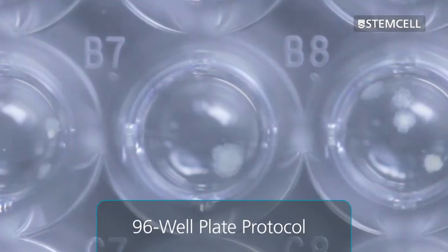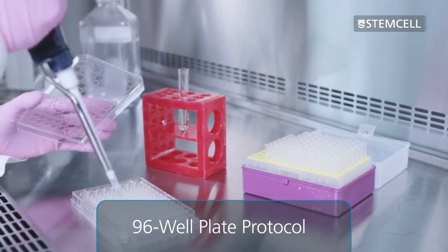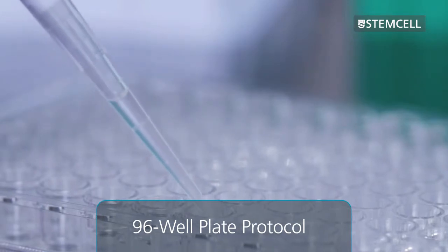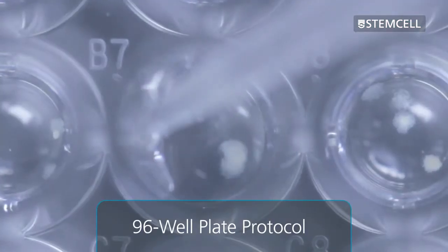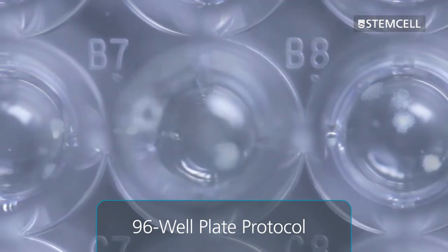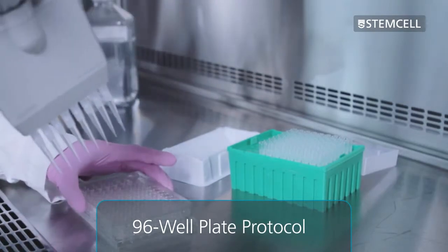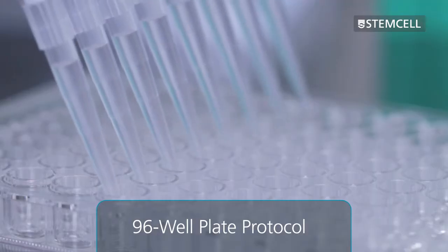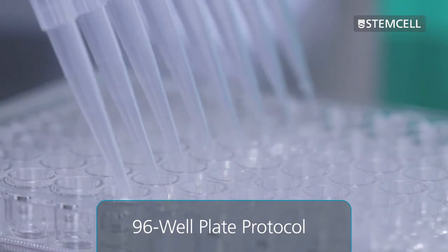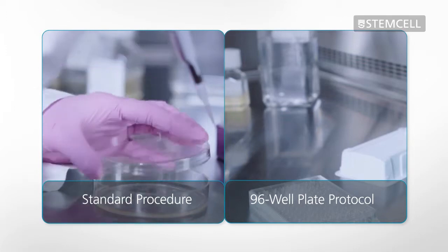As we will show in this video, in the 96-well plate protocol, freshly fused or transfected cells are also suspended in selective semi-solid medium, but the cells are plated directly into 96-well plates instead of 10 cm dishes. Colonies that grow in the semi-solid medium in each well are screened for protein production in situ. The advantage of this approach is that only those clones that produce the protein of interest need to be harvested.